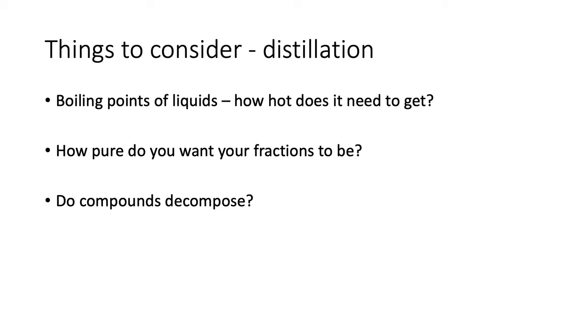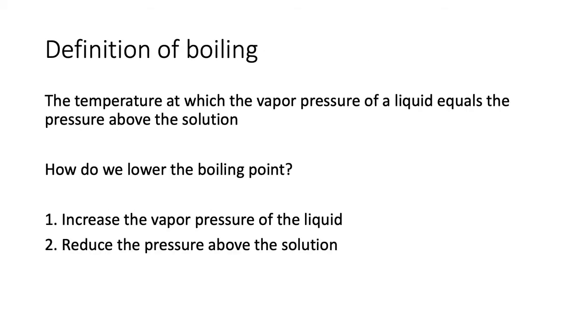If you don't really care about the purity of your fractions, then you can do a quick, simple distillation, collect your product, call it a day. And then, do your compounds decompose if you heat them too high? And in our case, yes, they do.